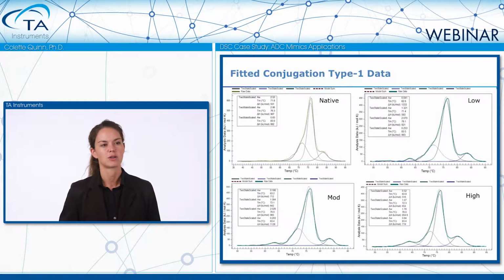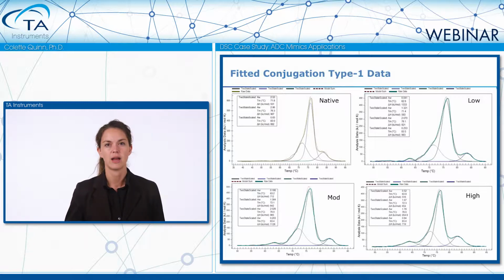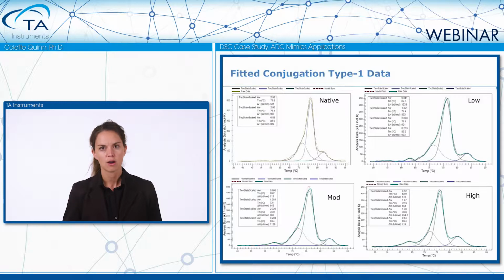With the enthalpy starting to grow, that gives us an idea, again just of the CH2 domain, that possibly we have an increase in this separate species, this species that has a lower energy level than the typical CH2. Now, it is a mixed species. We still have a little bit of that shoulder showing up, overlaying with the FAB domain. But we definitely have growth in this lower temp, lower stability species of the CH2 domain. So that's one way we could look at it.